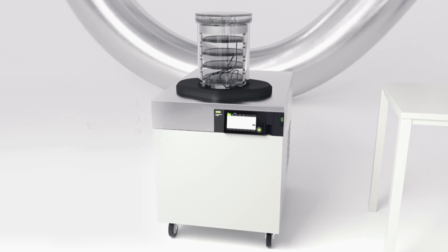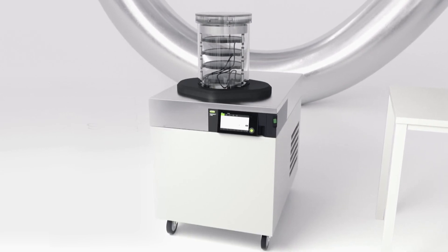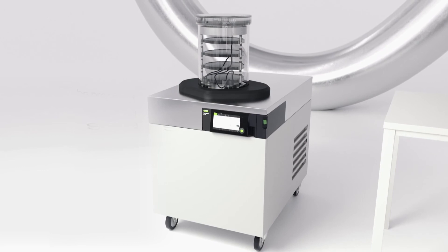In my experience, the L300 is straightforward to operate and is an economic and reliable method of continuous freeze drying.